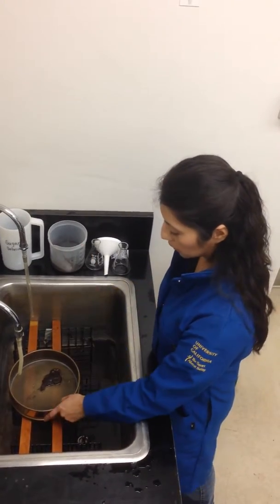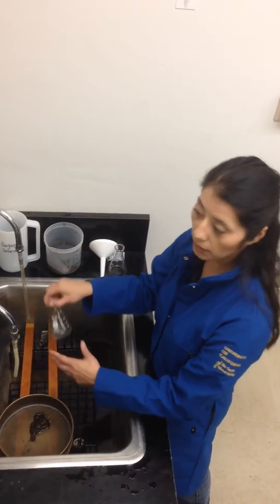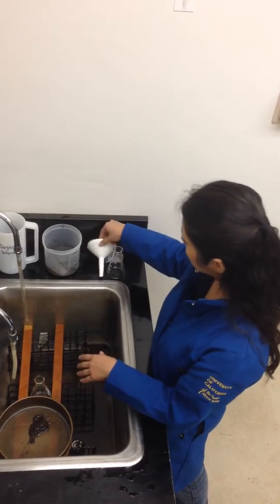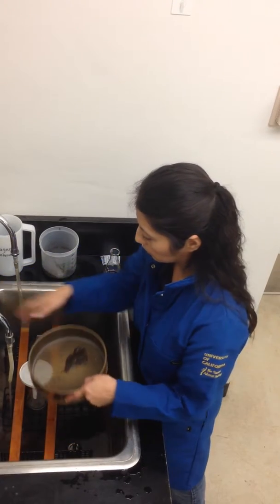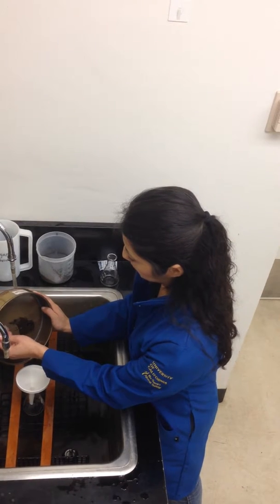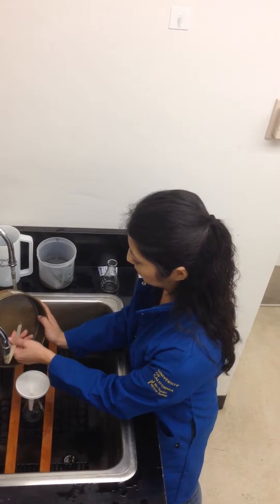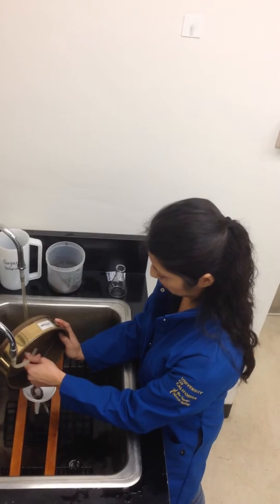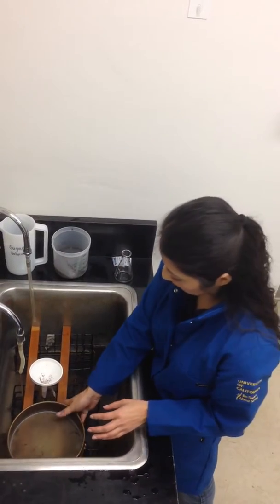Now we're going to wash the particles into a flask — it could be a one hundred ml to two hundred fifty ml flask. And you can use a funnel. Make sure not to overflow your flask.